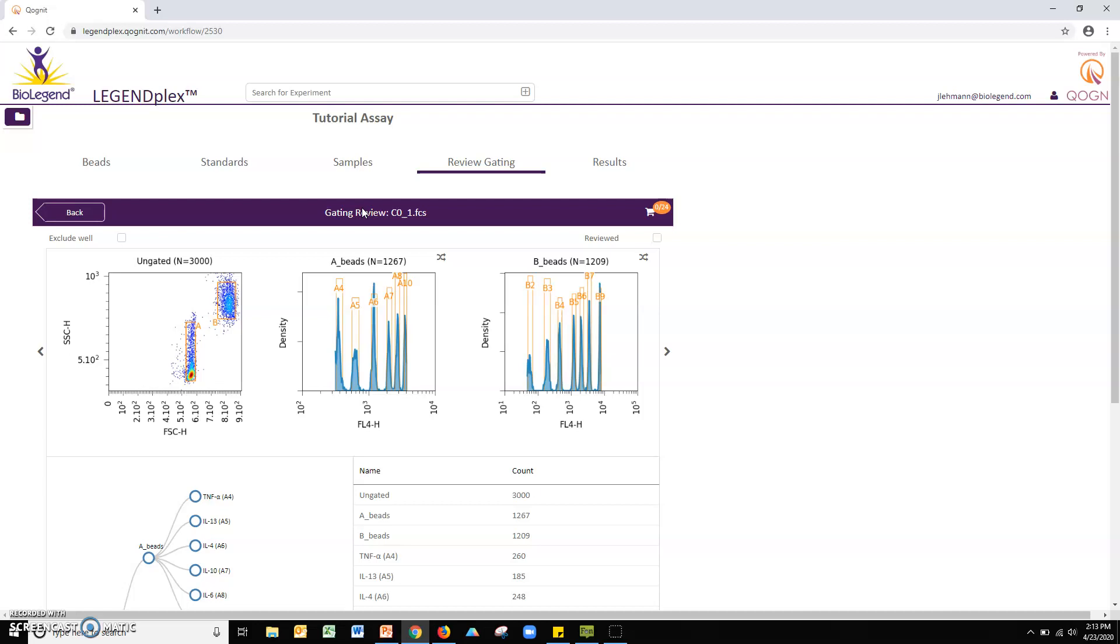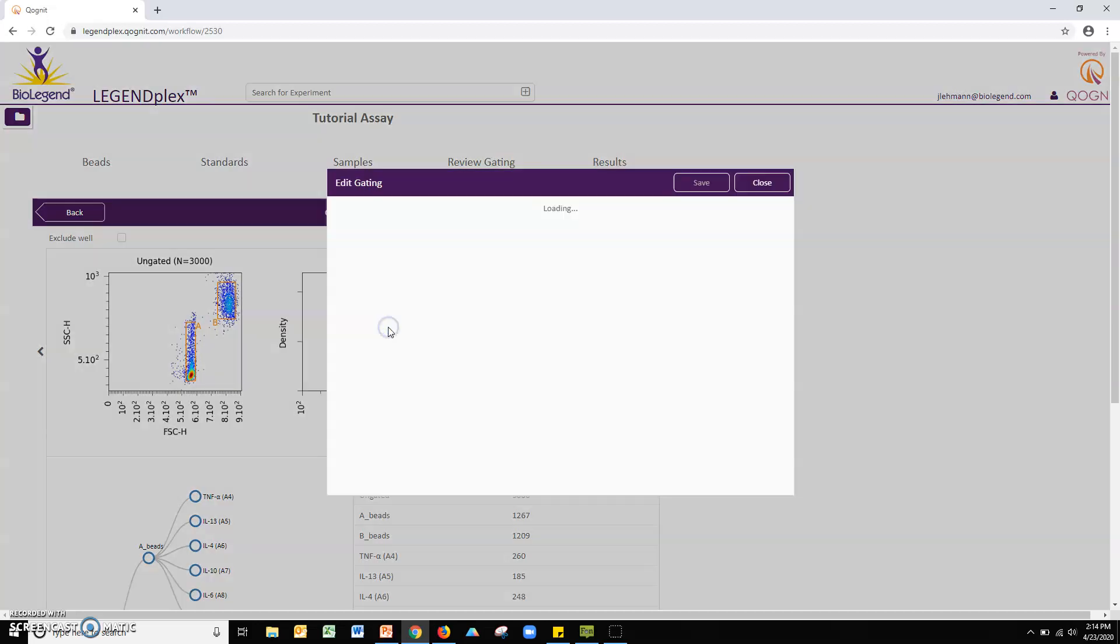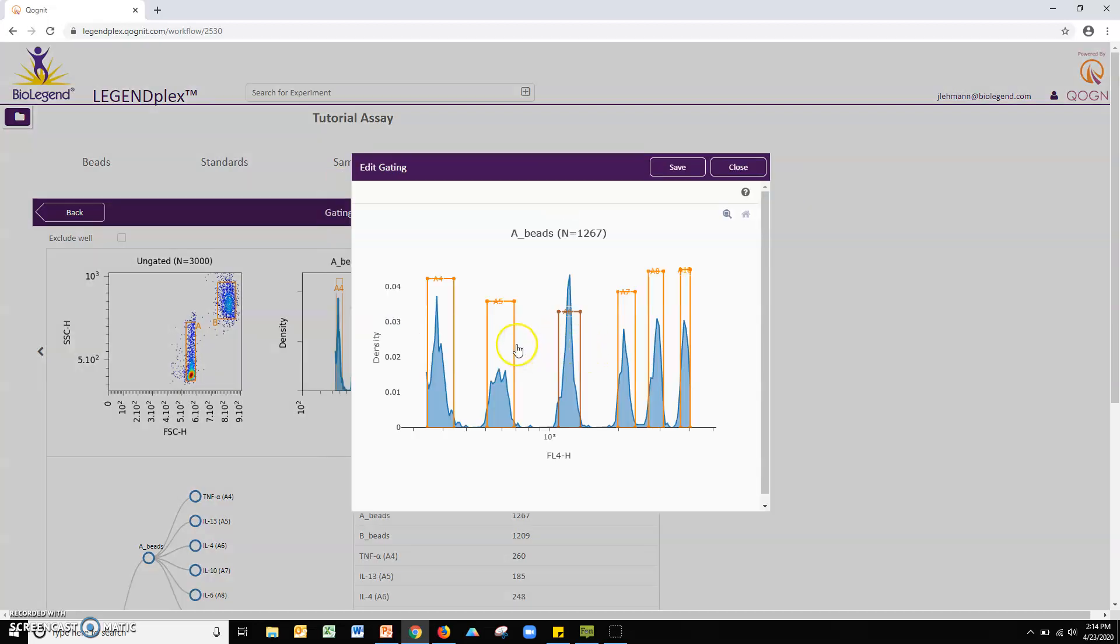For the displayed file, ensure gating accuracy in the sizing plot as well as both the A and B bead univariate APC plots. In the unlikely event of a gating error, please do the following. Click any plot to enable manual adjustments and fix the gating error. Remember to click save to apply any changes.